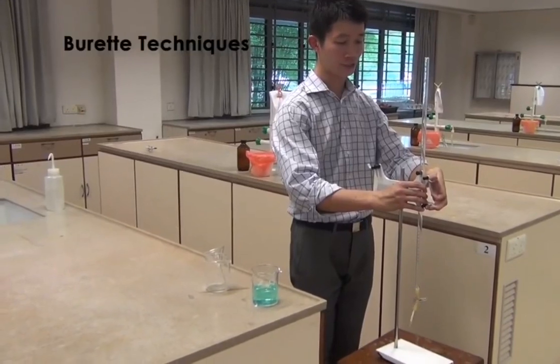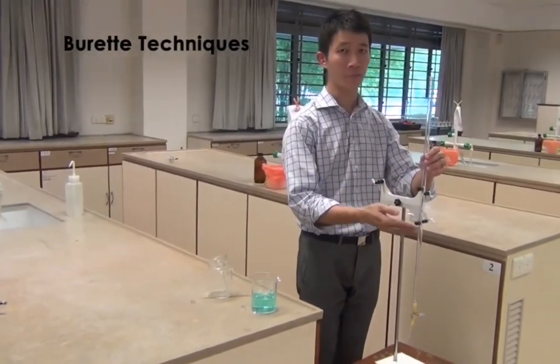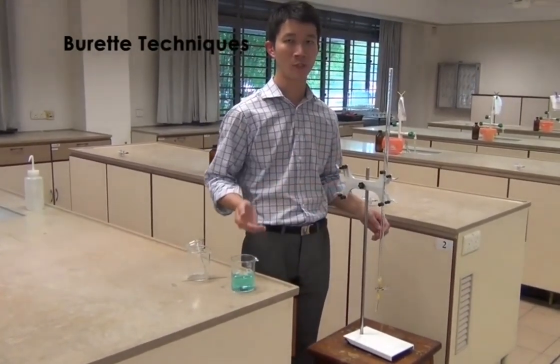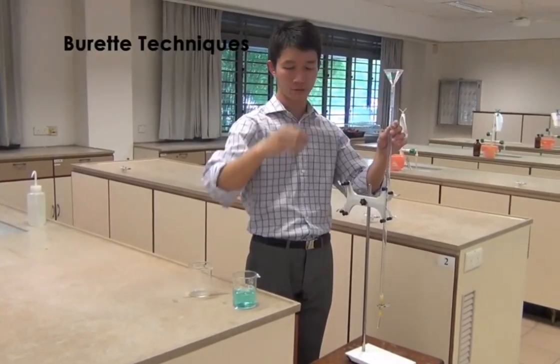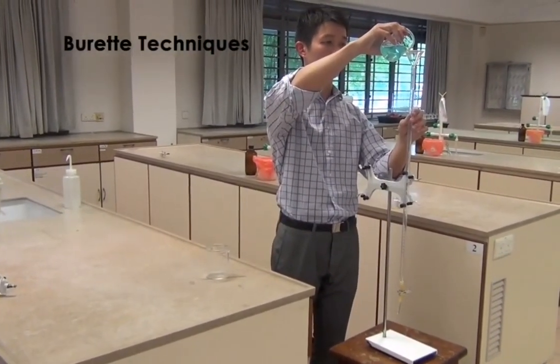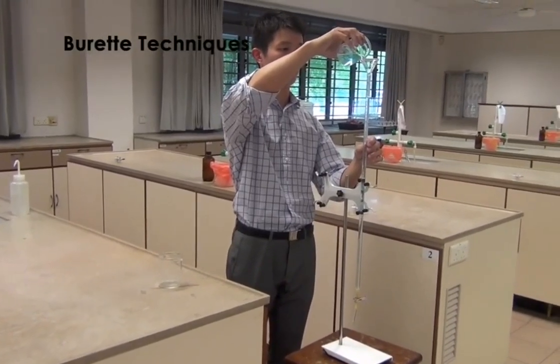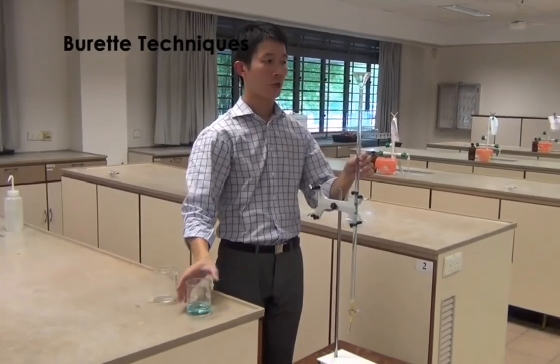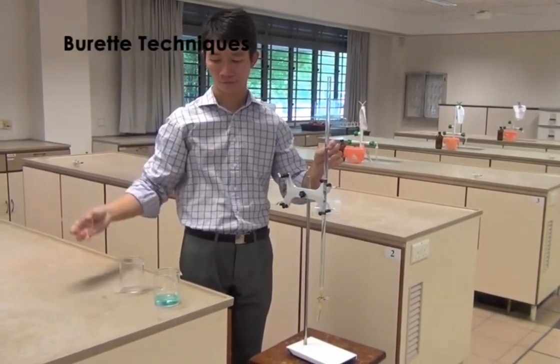Clip the burette back onto the retort stand. While doing this, make sure that the burette sits nicely onto the grooves of the clamp. Now, you may proceed to fill the burette with the solution that you will be using for the titration. Place the glass funnel back onto the burette. Slowly, pour the solution into the burette through the glass funnel. Pour the solution until it is slightly above the 0 cm³ mark. Remove the glass funnel.